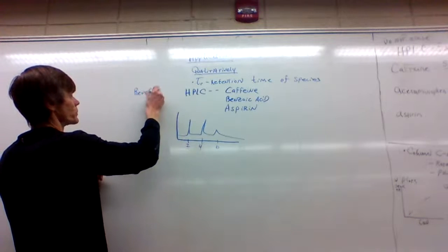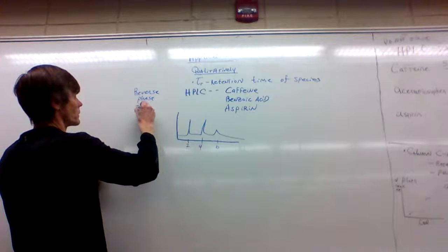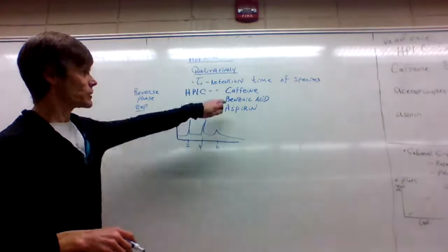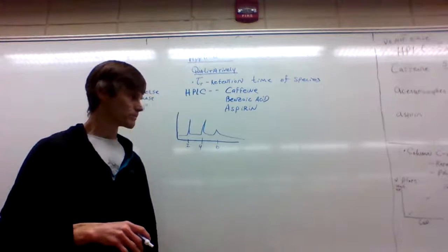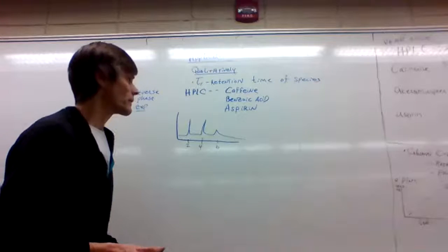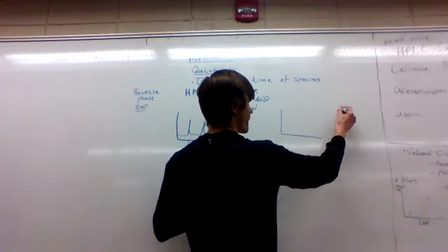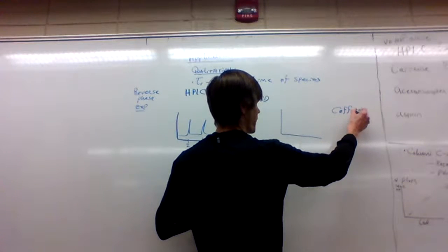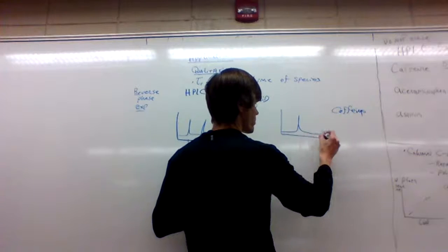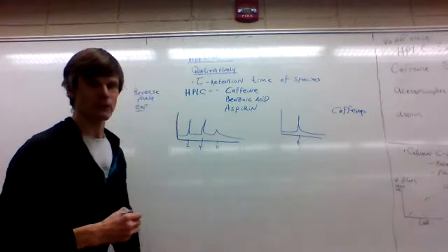Just to let you know, this is a reverse phase experiment. First phase, non-polar column. Each of these are fairly non-polar. So what we would do in a real life setting is we would run caffeine separately, all by itself. And we find out that it has a retention time of 4 minutes.